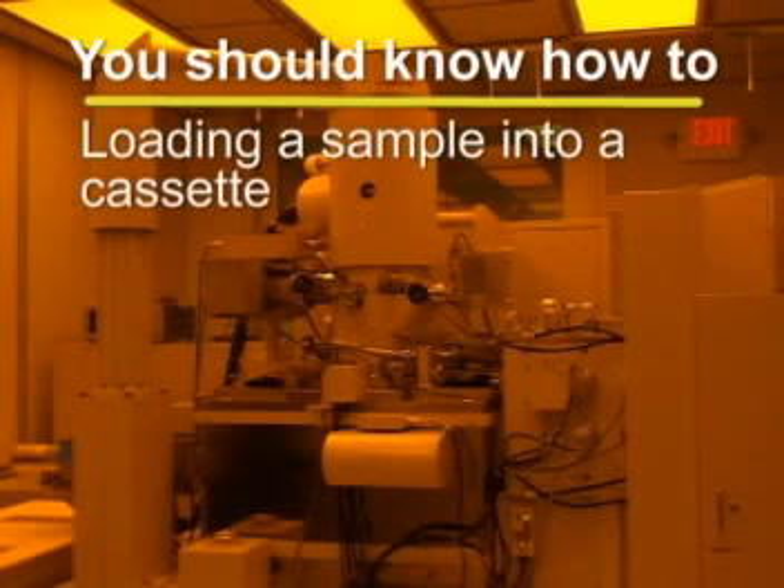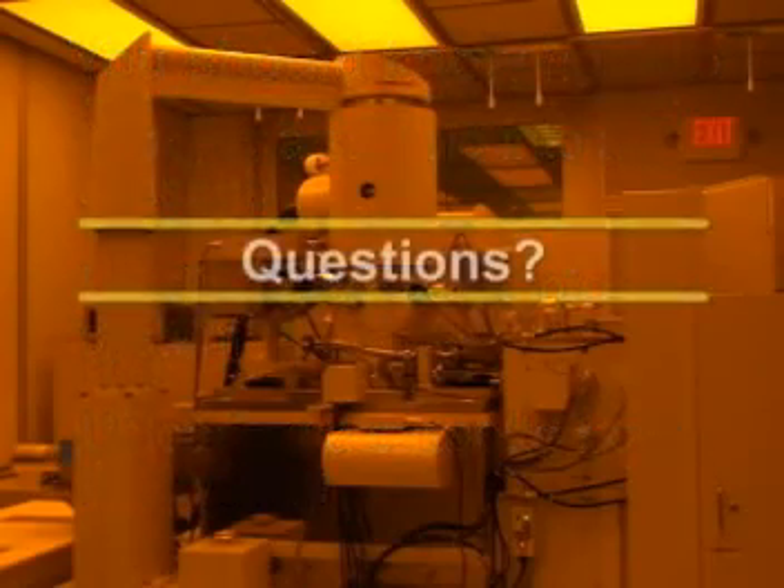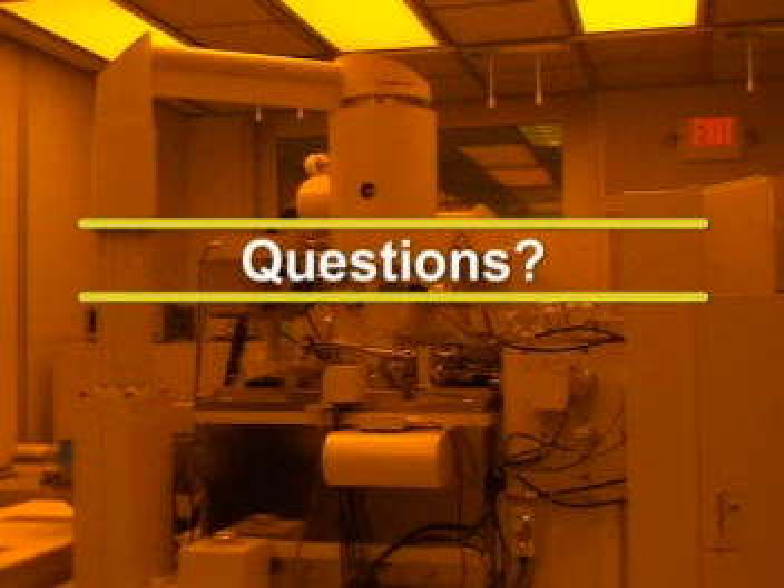You should now have a good understanding of the proper etiquette and basic procedures for loading a sample into a cassette, loading a cassette into the system, and unloading a cassette from the system. If you have any further questions regarding the content of this training video, or if you wish to learn more about the processing capabilities of the JBX9300FS, please contact the trainer for this equipment.